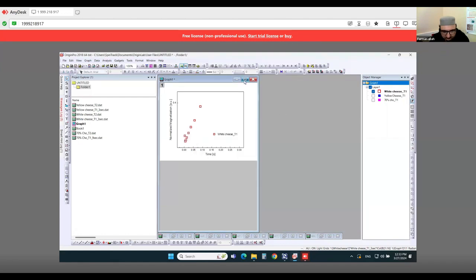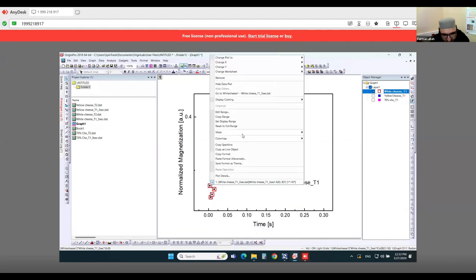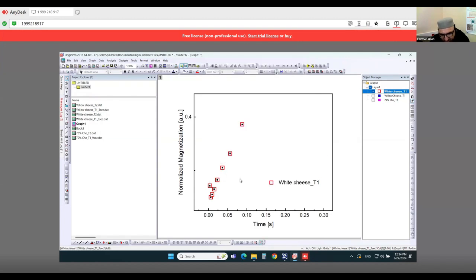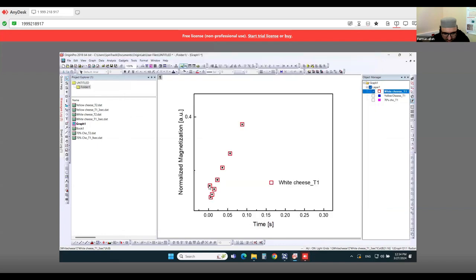I do not want this, I want here. And how will you mask? Go here and right click, and you have the option of masking, mask. So it is not operating. If first I want to disable, then I will apply mask again, enable masking. Okay, when you do this, you can go to the workbook.